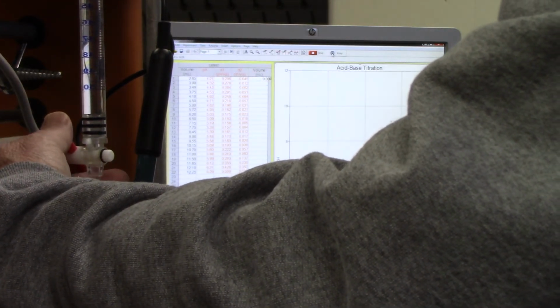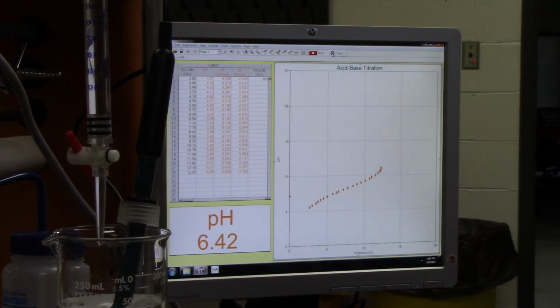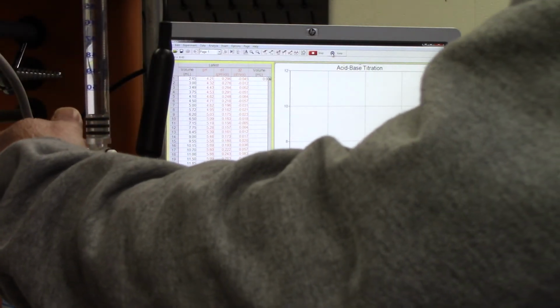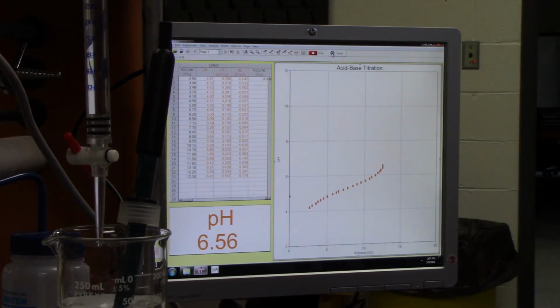Go up to 3.9, or about. 12.5. Okay, you've got to go up to about 6 point, whoops. Okay, I had it down, so it's 12.7.